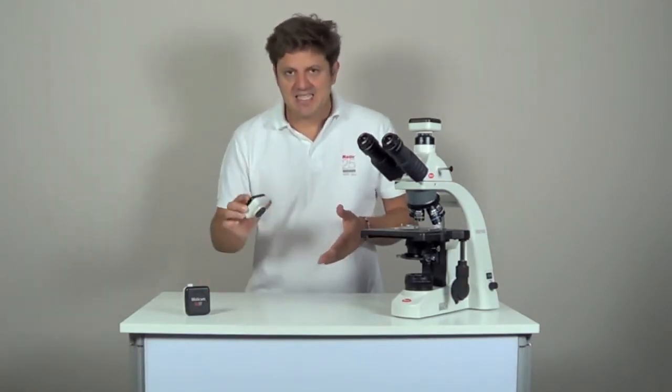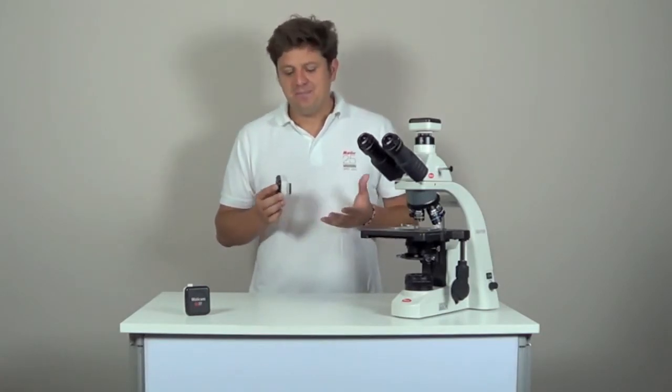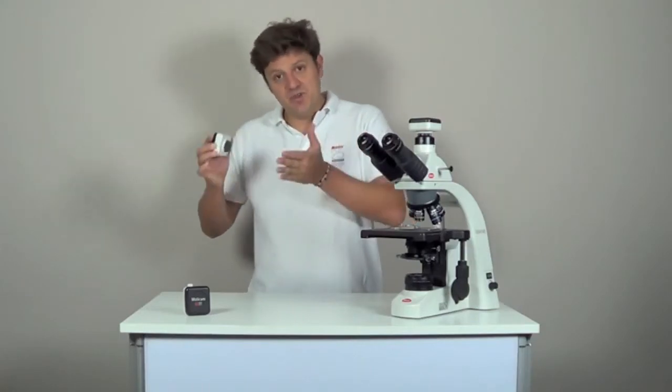Moticam 5 and Moticam 10 are higher resolution cameras with a resolution of 5 and 10 megapixels respectively. They are meant for documentation, so printing and publishing. In fact they have a higher pixel density and this makes them a bit slower than Moticam 3. They have a specific use, which is taking images for printing afterwards.